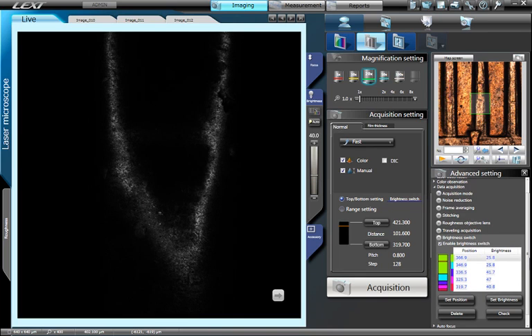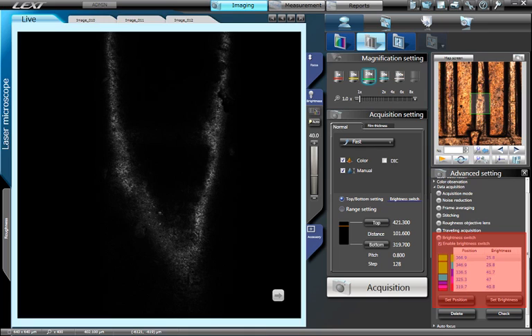Some applications, for example, imaging inside cavities or vias, may require independent brightness levels at various depths. The LEXT incorporates a brightness switch where the user can program independent brightness levels at up to five different Z positions.